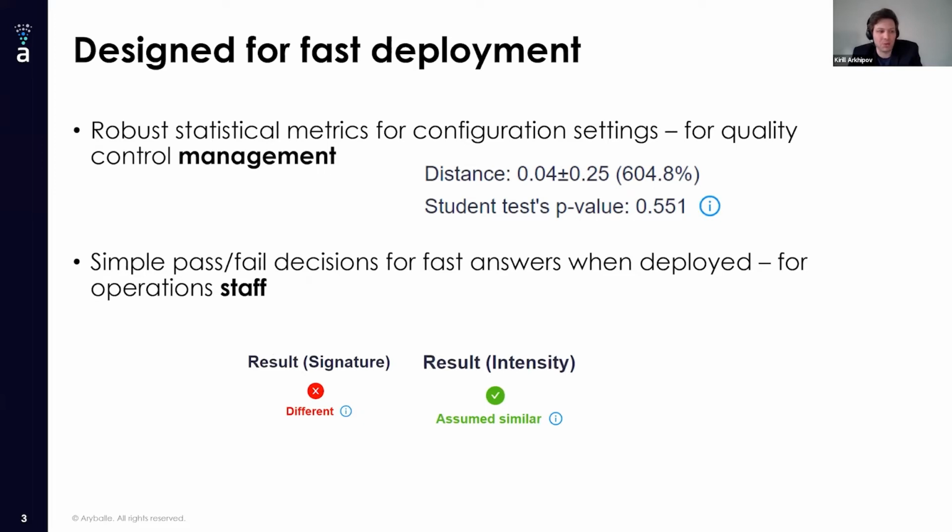So we've been designing this tool with deployability in mind. We actually came up with this design solution that led us to separate the activities for quality control management: setting up the environment, preparing the samples, making sure that the protocol respects the business process and the quality control management pipelines at customers. So this is sometimes complicated stuff. It totally depends on samples. So we try to make the software at this part as flexible as possible, and as rich in information as possible.